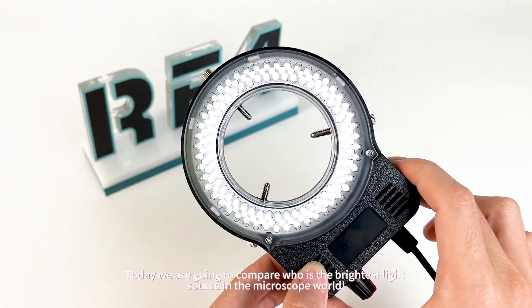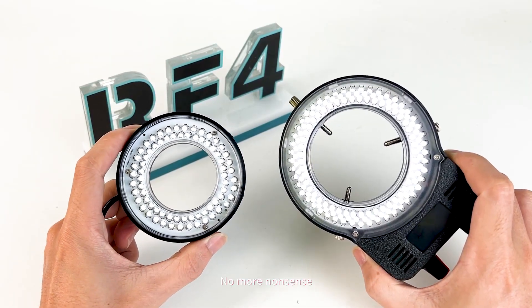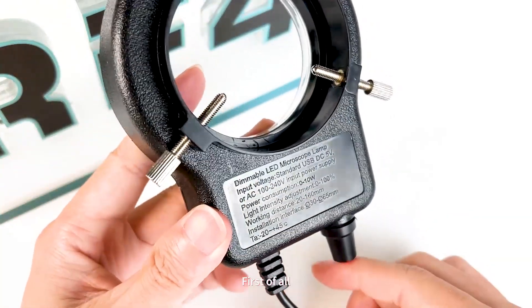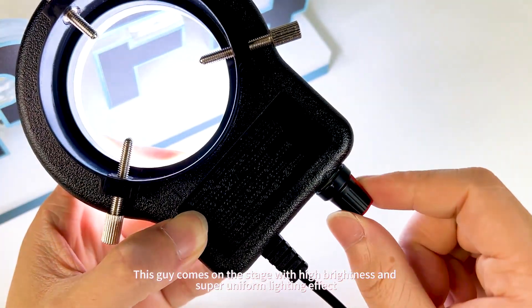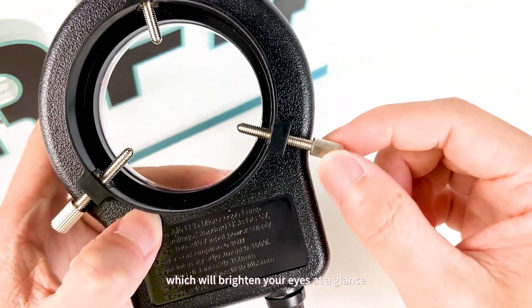Hey everyone, today we are going to compare who is the brightest light source in the microscope world. Let's make a comparison right away. First of all, we have a big killer: the 144 lamp beads light source. This guy comes on the stage with high brightness and super uniform lighting effect, which will brighten your eyes at a glance.